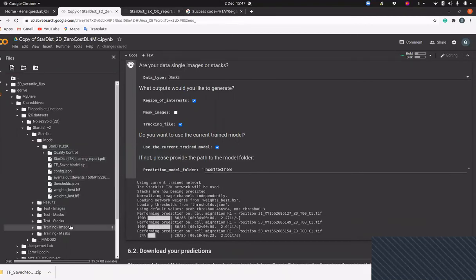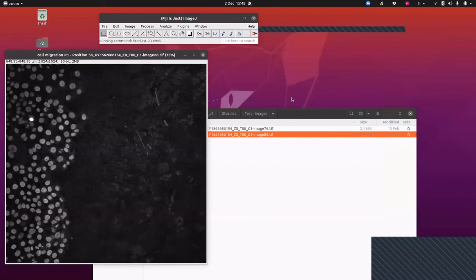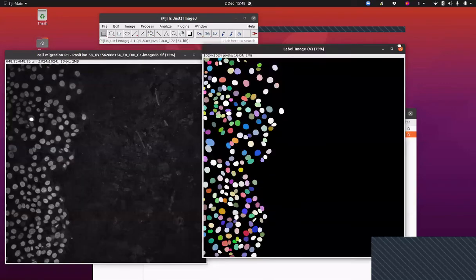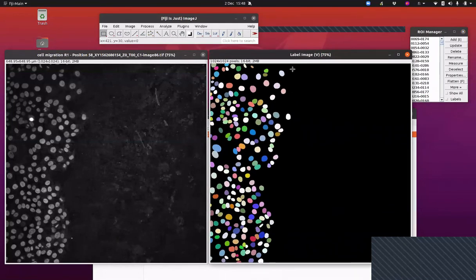Oh, okay. So no, that's not what you need. The only file that you need to use in StarDist is within the model folder. There's something called tf_save model.zip. That's the only one. That's the one I downloaded. Yeah. So that's your model being exported so that it's compatible with the Fiji plugin. I see. Okay, should work now. Thanks. And then if you now click OK, and you have the right TensorFlow library and everything, then it should hopefully give you a nice segmentation image.